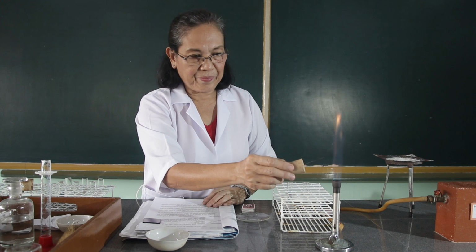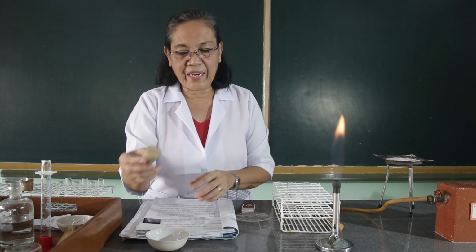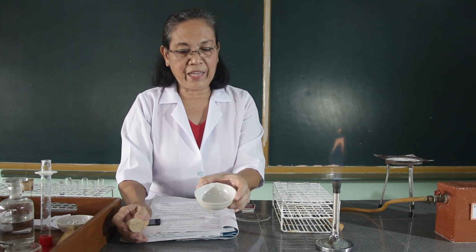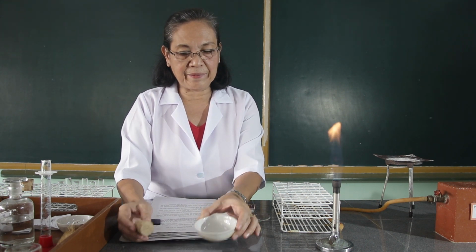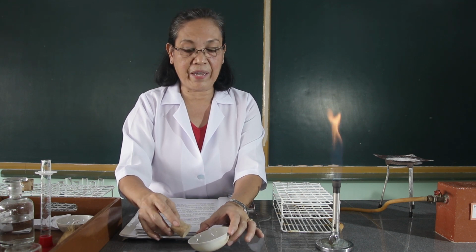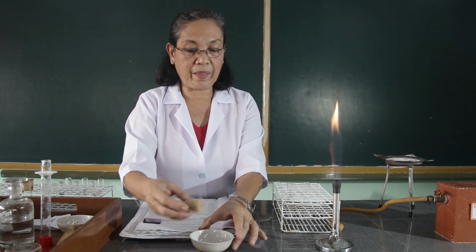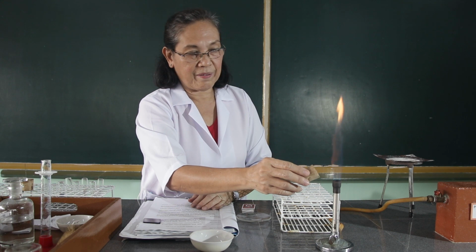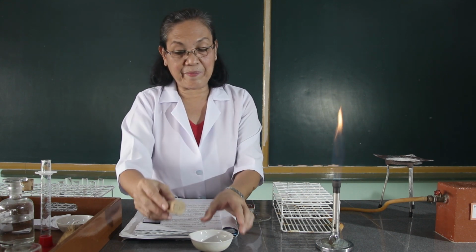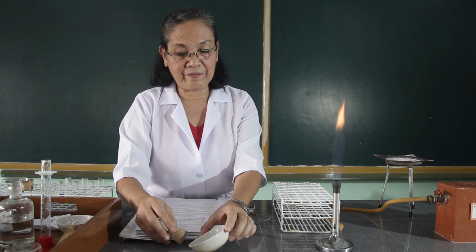So this time, we're going to dip this nichrome wire into the mixture of the sodium carbonate and the potassium carbonate. And I want you to observe the color imparted by the flame. Again.